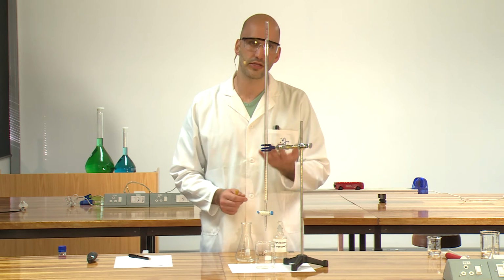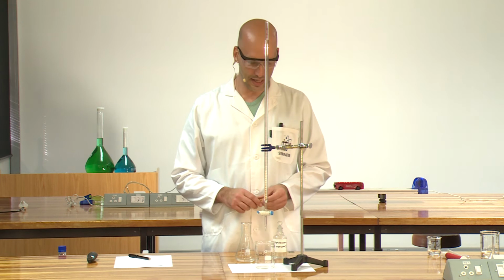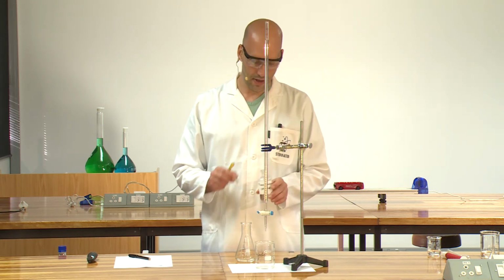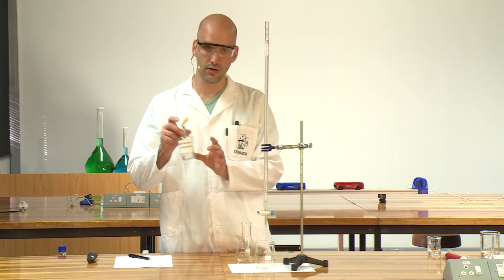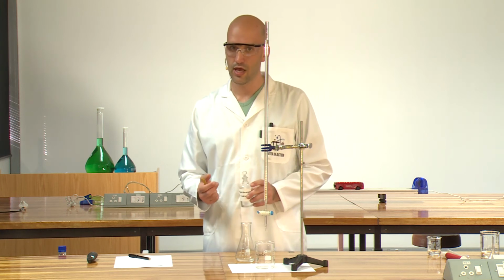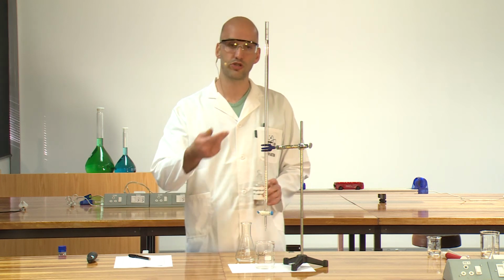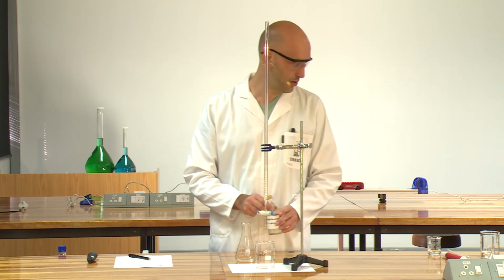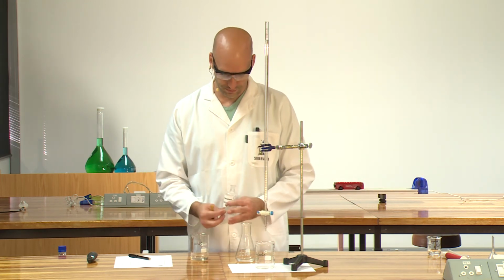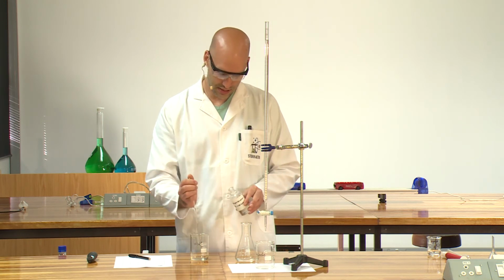And we know that sodium hydroxide is a strong base and oxalic acid is a weak acid. So my indicator choice is phenolphthalein. You'll see phenolphthalein is a clear liquid. When we add it to an acid, it's still going to stay clear, because in an acid environment, it's a clear liquid. I can actually show you that. Let me demonstrate it. I've got a little bit left over here. Let's take the phenolphthalein and we just add a couple of drops in there.